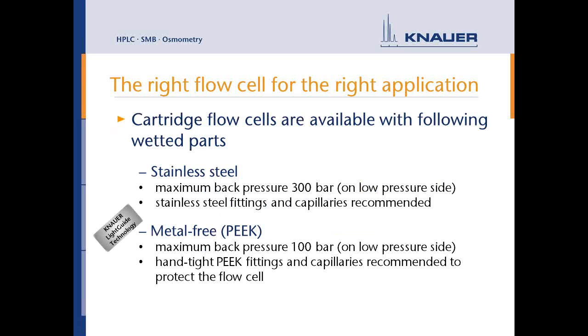And what makes these, I call them the standard Knauer flow cells, really quite special is that they can withstand a really high back pressure. They can withstand up to 300 bar back pressure, and they are made out of stainless steel. So I'm not going to have to worry about using PEEK fittings in capillaries, which I do have to look at when I'm using the light guide technology.